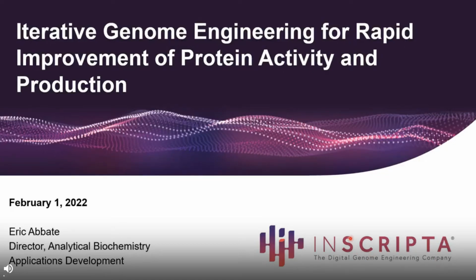So today I'm going to give you an introduction to Inscripta's Onyx platform and tell you about the iterative genome engineering workflow on that platform. Then I'm going to tell you about a few applications where we use this iterative genome editing in order to improve the function of a protein as well as the expression of a heterologously expressed protein in yeast.